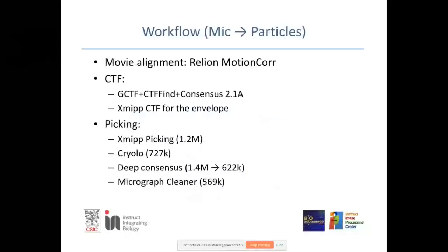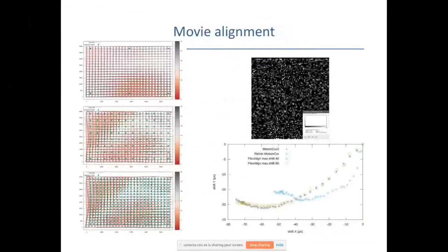Okay, so we will go from the movies to the particles. The first step is movie alignment. For the movie alignment, I would like to show what a frame looks like. A frame looks something like that.